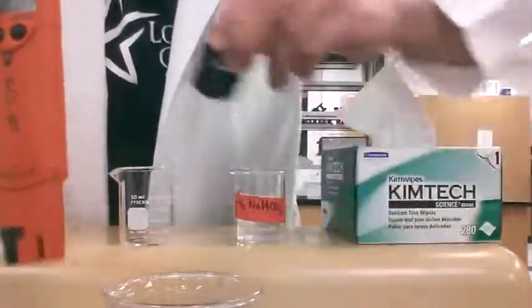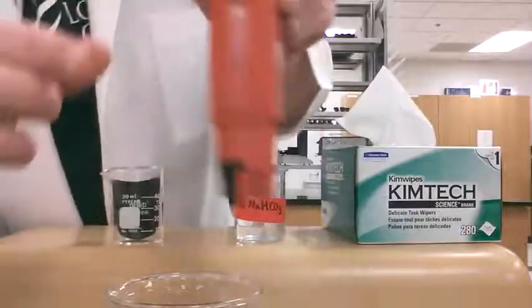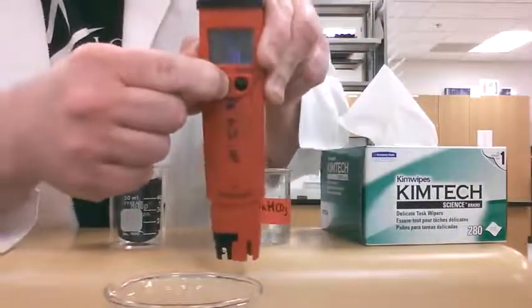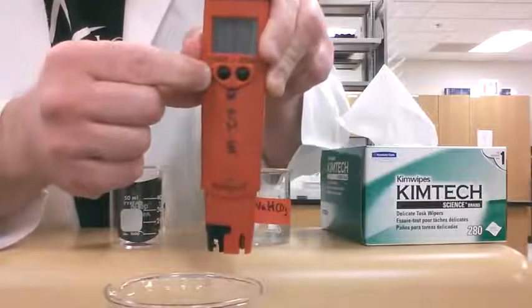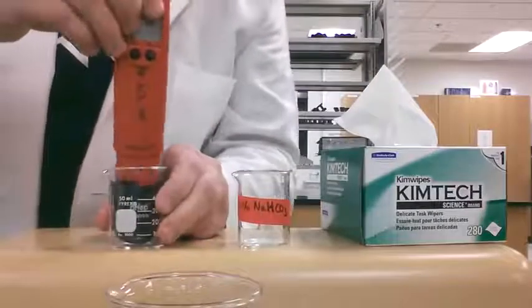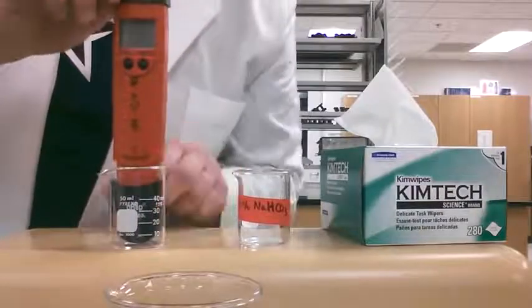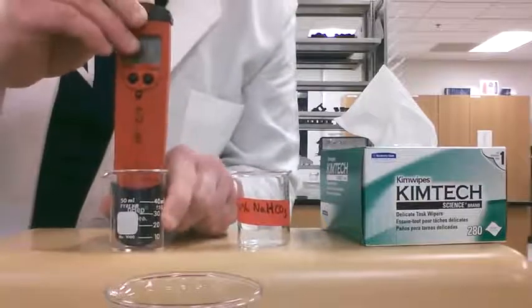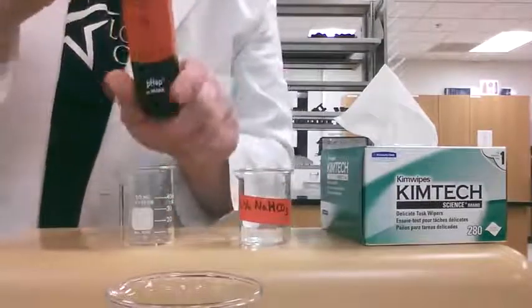We're going to hold the power button for one full second again until it says off. Once it's turned off, you can put the cap back on — you can do this by leaving the cap inside the beaker that you had it in and pushing down to snap it on.